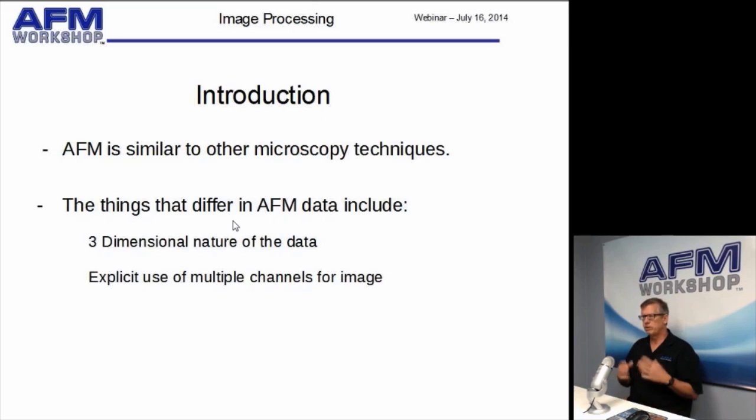Second is there's an explicit use of multiple channels, and that is that you can get two channels, say the topography image and the phase image, or the topography image and the lateral force image.